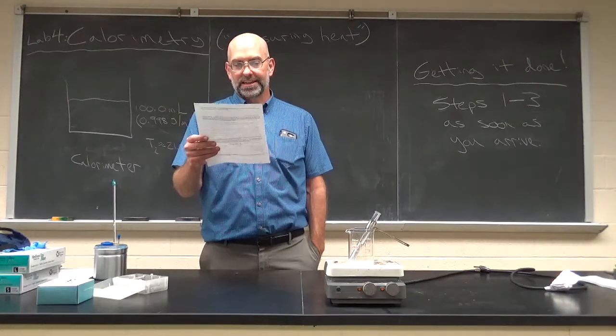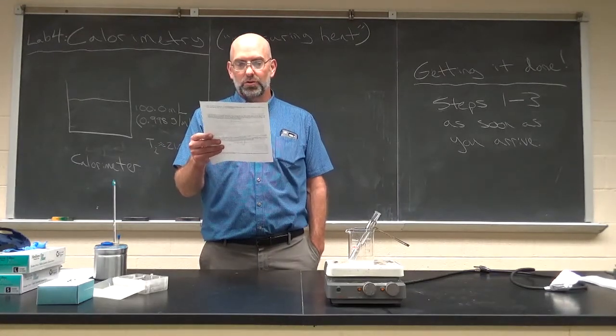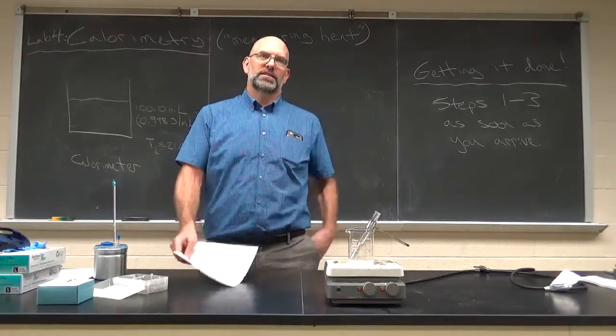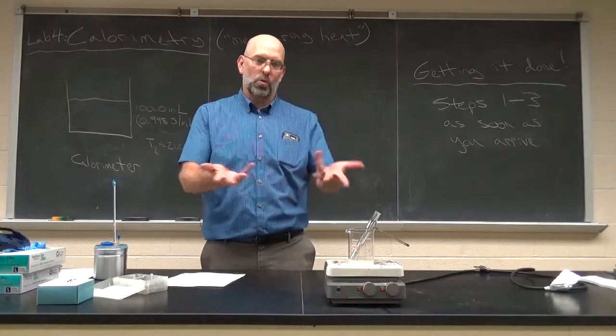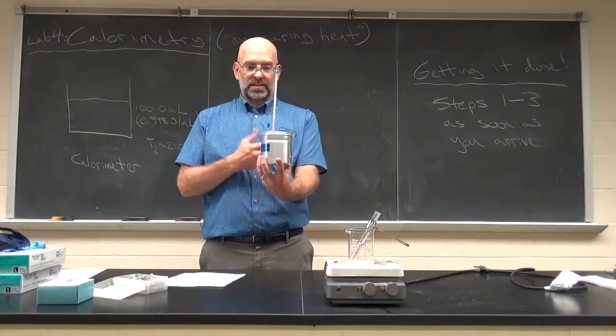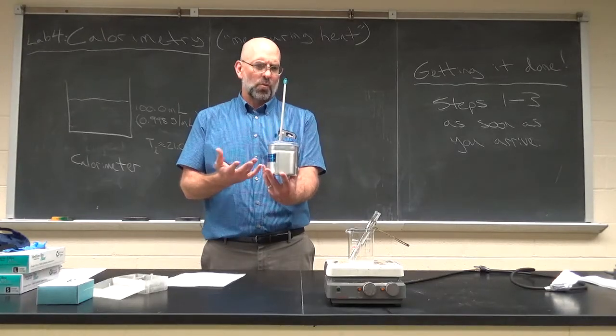While the cylinder is heating, nest 2 foam coffee cups together. Well, we can do that, and taking 2 coffee cups and putting them together and putting water in is fine. We may actually end up using this. So it's a little bit more sophisticated, but styrofoam works well.